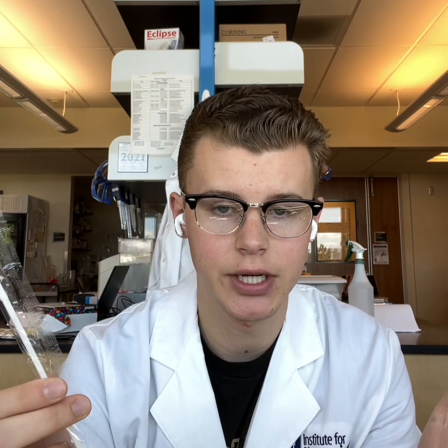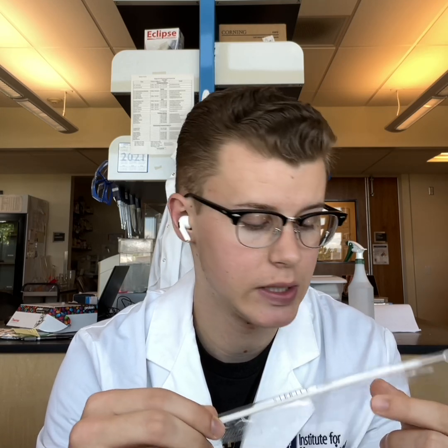At that point, you will take an inoculating loop. You'll see there's a large side and a small side. I would use the large side first. You can really use either side, to be honest. And then streak a YPD plate after you've made the YPD agar. There are instructions in our notebooks, so just refer to mine and Hannah Schultz's notebooks.